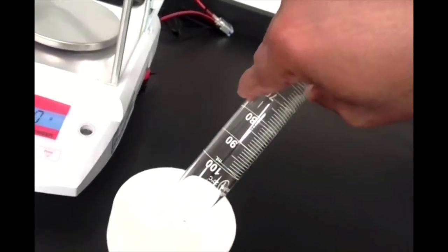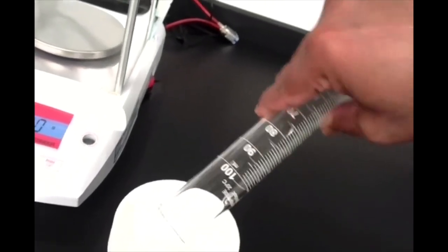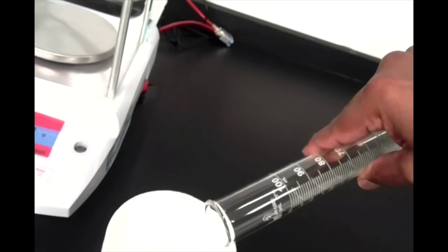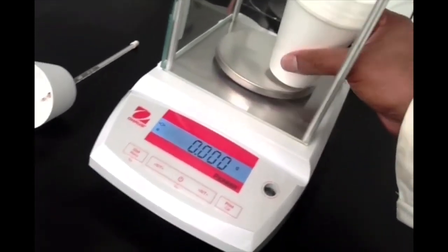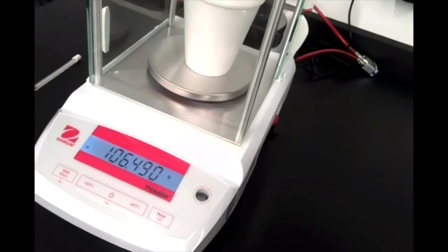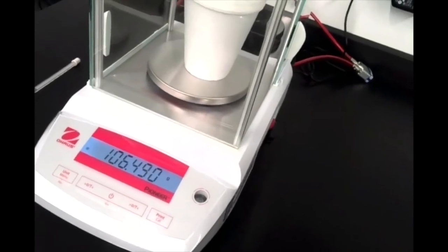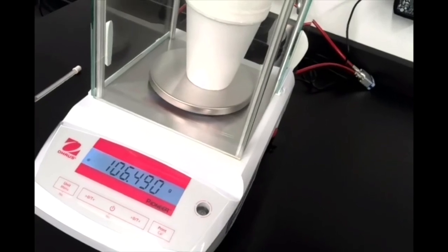The actual volume isn't that important because we're going to figure out how much water is in there by using mass. So let's go ahead and make a note of the mass of our styrofoam cup with water in it. Okay, so there is our mass of the cup and water together.